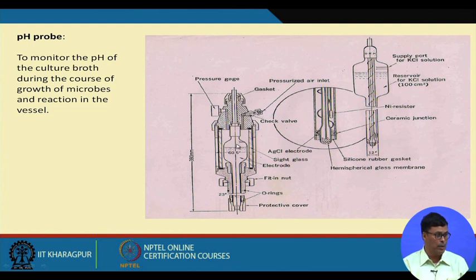If we don't maintain the pressure, the liquid can enter the porous glass, affect our electrolyte and damage the system. To avoid that, we should have 15 psi pressure above the electrolytes, so that no such damage can take place. This is the special device that we have in the fermenter for the pH probe.